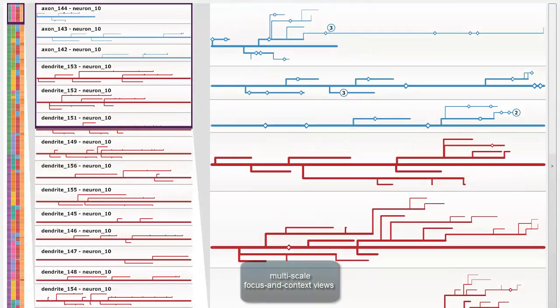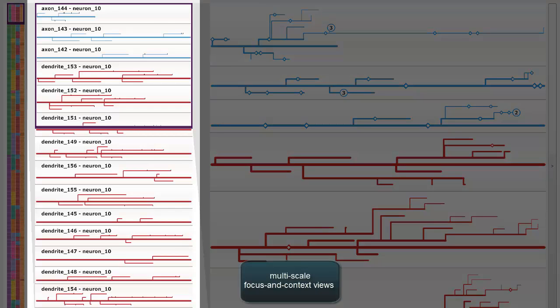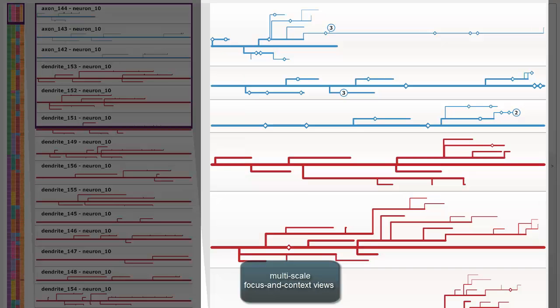To be scalable, we have developed a multiscale view with three different tiers that show different levels of abstraction for neurites.